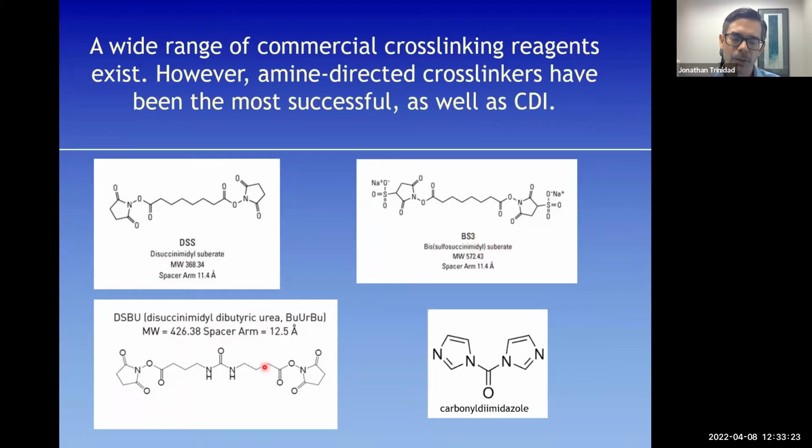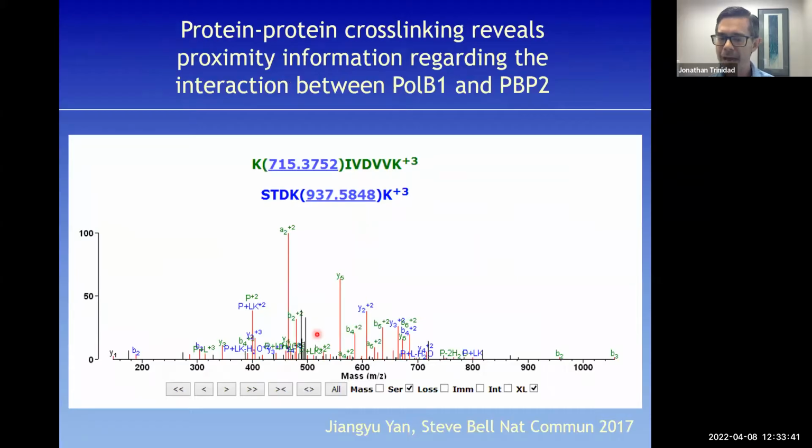This is a somewhat newer version, but the fact that it will also break apart during MS2, in my experience, seems to indicate that when we get secondary fragments, we basically separate the crosslink, and then the machine is able to fragment the two halves because they're separated now independently.